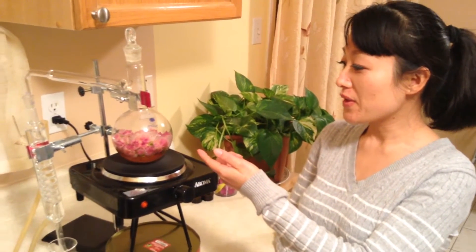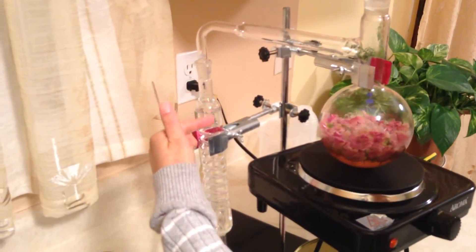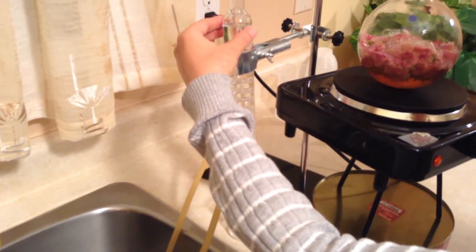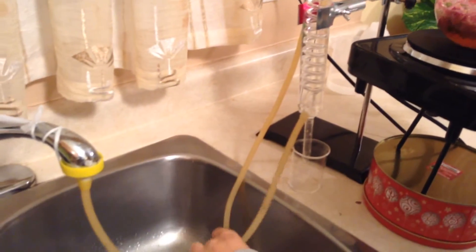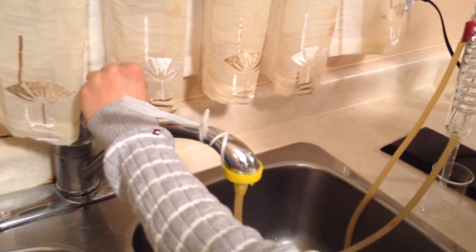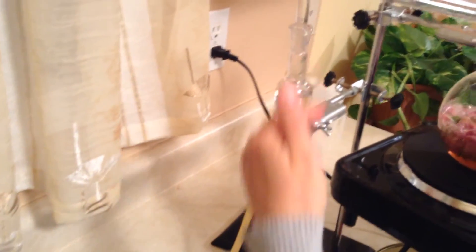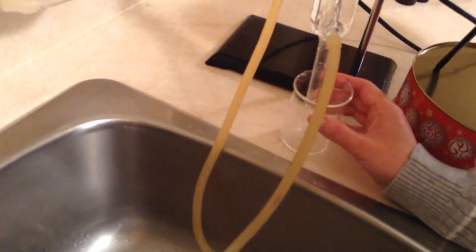The water is boiling. From the condenser tube, we can see some water coming out — you can see here, it drips from the outlet. If you touch the top of the condenser and it feels a little bit hot, that means you should turn on the tap water. First we connect the tap water so the cold water enters and cools down the steam, and here you can see the condensed rose water collecting.